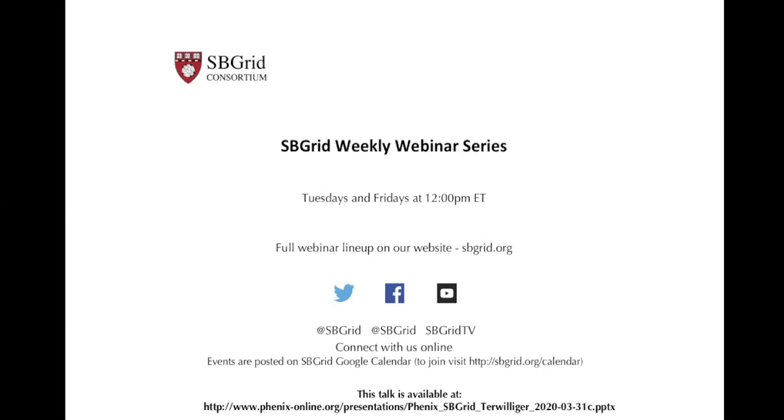In the high resolution range, typically it sharpens up, it looks a little bit better, and things are a little bit cleaner. I haven't seen anything where this is a totally different map from a high resolution map, because the high resolution maps typically are actually very good up to high resolution.